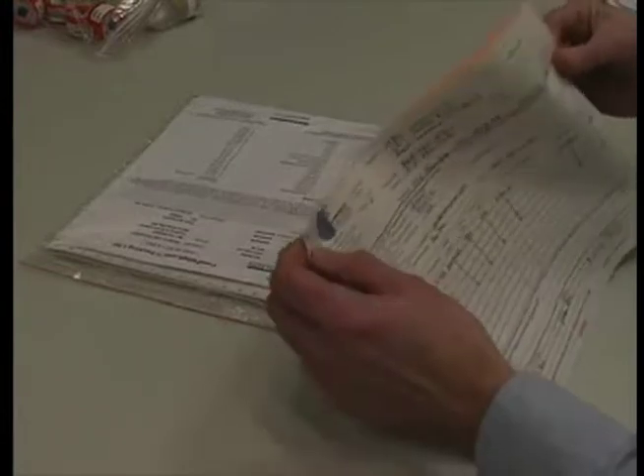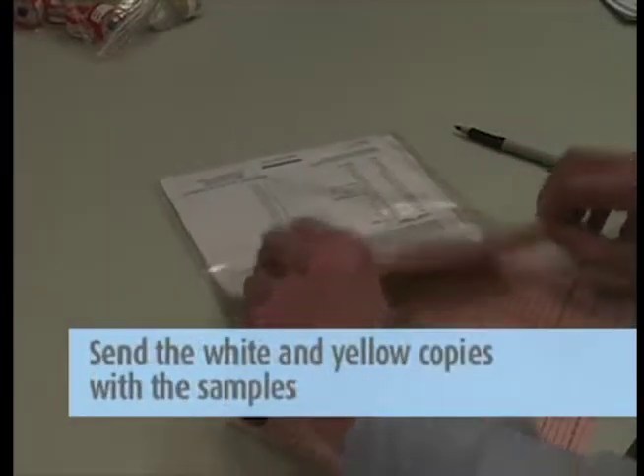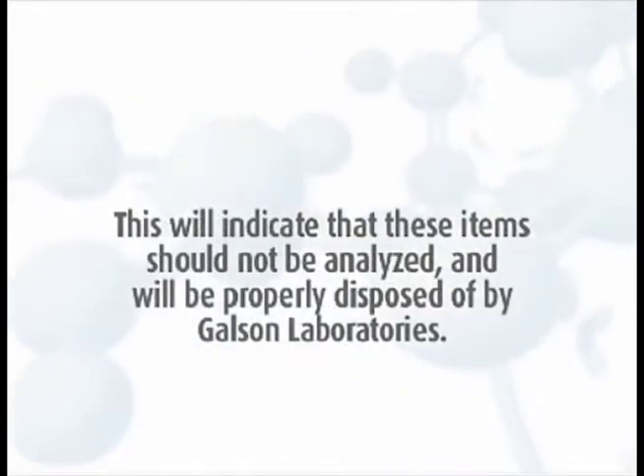Complete the chain of custody form. It is important that you include all the information requested in order to ensure the turnaround time of your samples. Remove the pink copy and keep this for your records. Send the white and yellow copies in with the samples to the lab in the large Ziploc bag. Please place any unused media in the Ziploc bag marked with the orange Unused Media label. This will indicate that these items should not be analyzed and will be properly disposed of by Galson Laboratories.